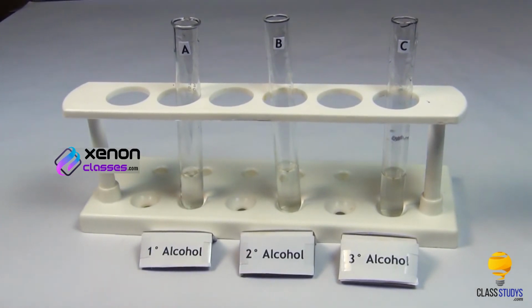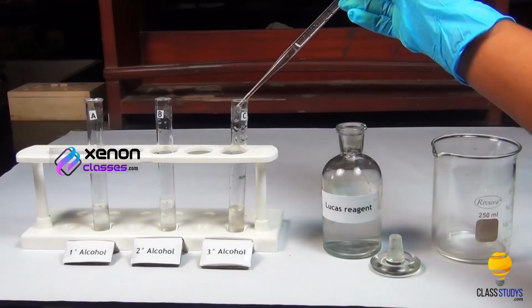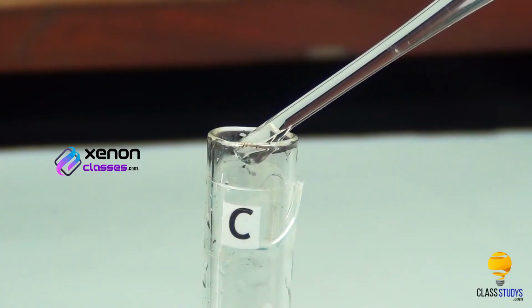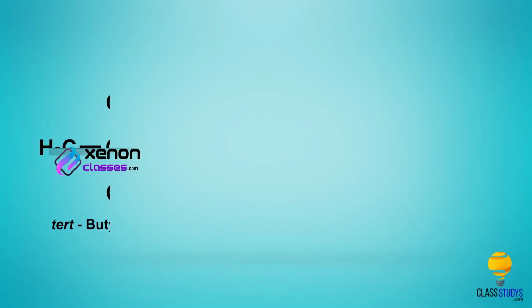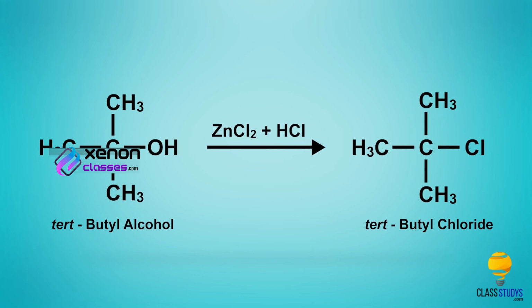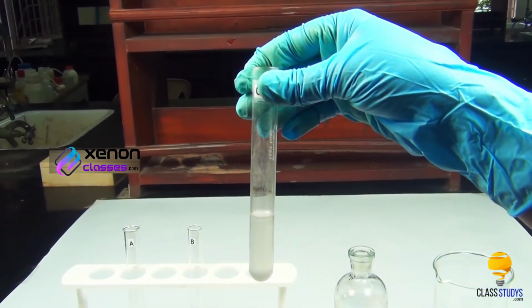Using the dropper, add a small quantity of Lucas reagent into tertiary alcohol taken in test tube C. Shake the test tube well. Tertiary alcohol reacts instantaneously with Lucas reagent to form alkyl chloride, which being insoluble results in cloudiness in the solution.